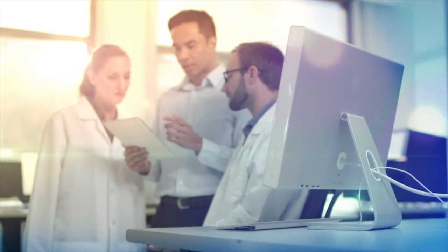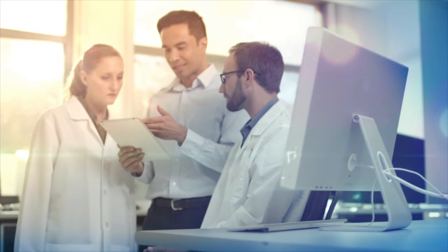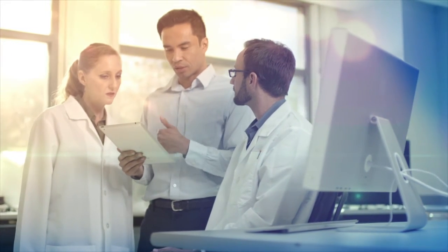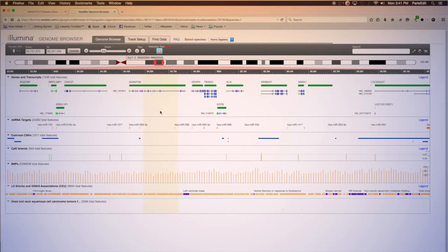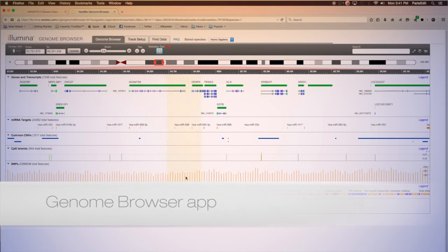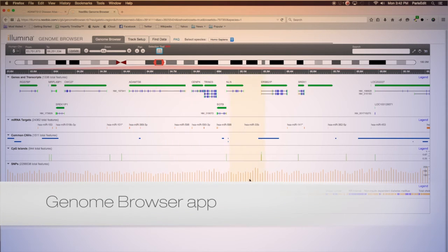Visualize experimental data sets and interactive displays for a unique perspective to your genomic data with the Genome Browser app.